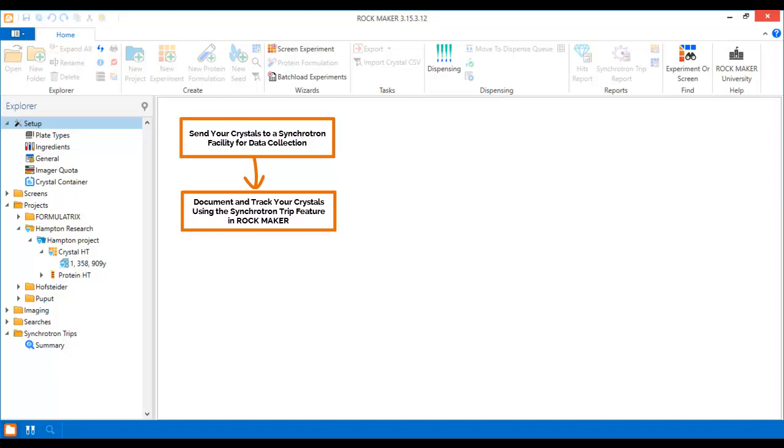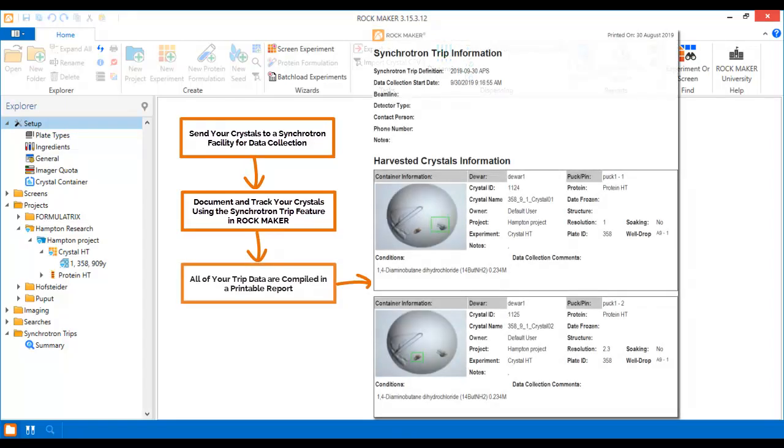From picking which pucks and doers you want to use, to virtually harvesting your crystals before you harvest the real ones, to storing all of your trip data in an easy-to-use report, RockMaker makes it easy to plan the logistics of your synchrotron trip so that you can focus on its results.